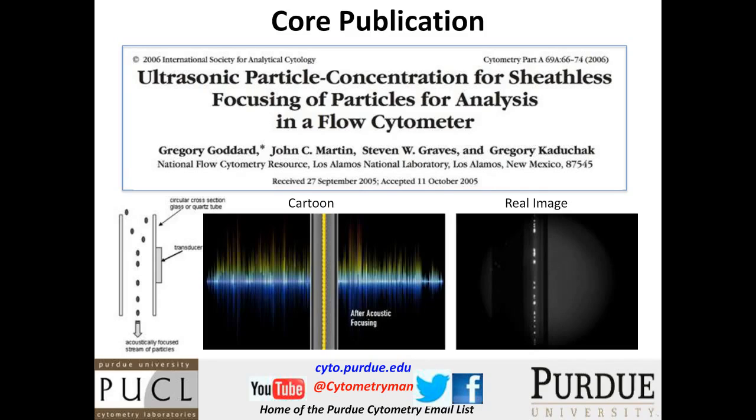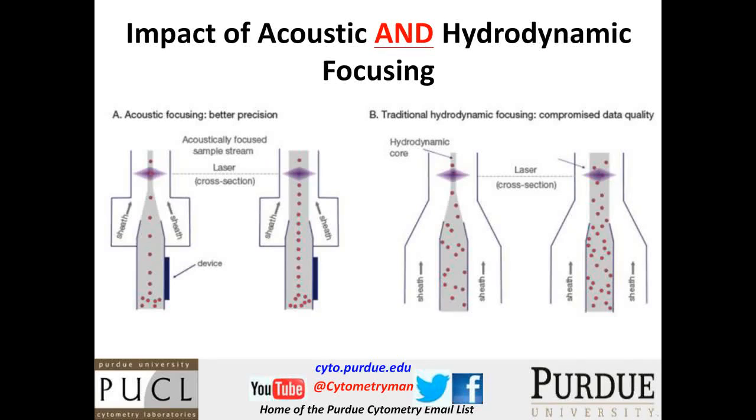So from these early experiments, Greg was able to show, wow, this really will work on a flow cytometer. And there are some advantages to this. And that's really the key point of this webinar, is to explain some of the key advantages of acoustic flow cytometry.